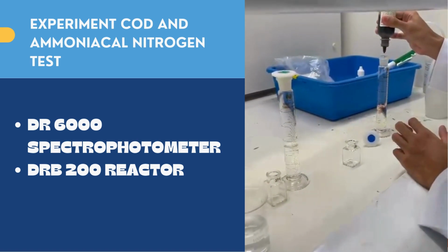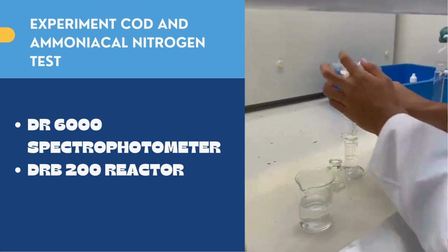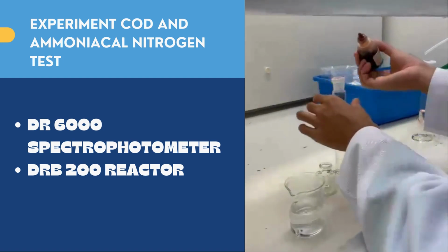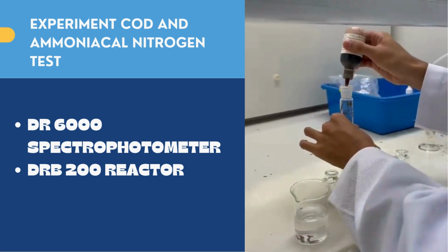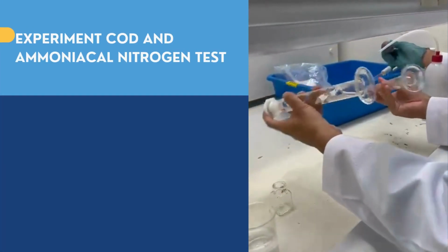In this experiment, we need to prepare the sample and place it in the reactor for 2 hours. After that, we obtain the COD value from the DR6000 spectrophotometer. COD is widely used as a measure of the susceptibility to oxidation of the organic and inorganic materials present in water bodies.